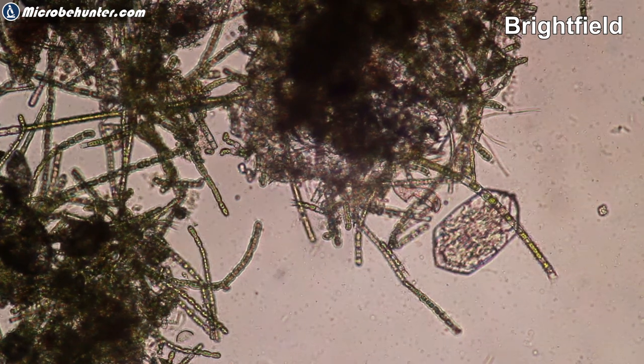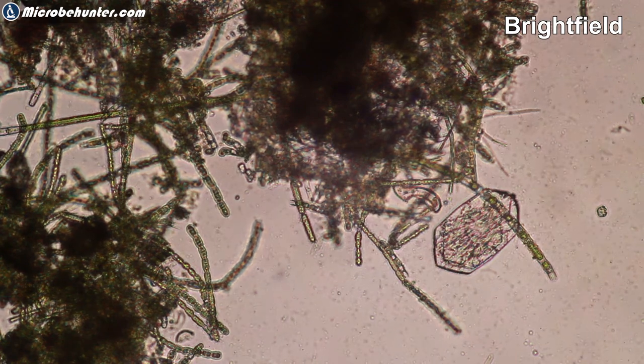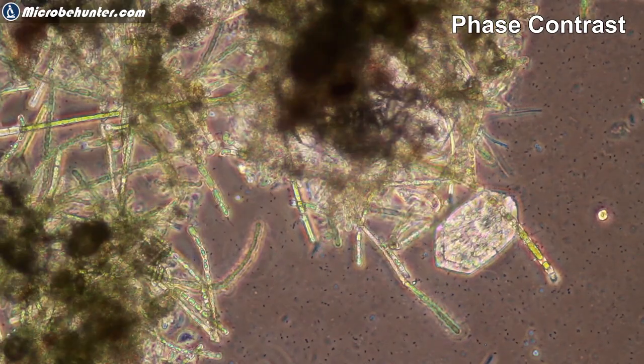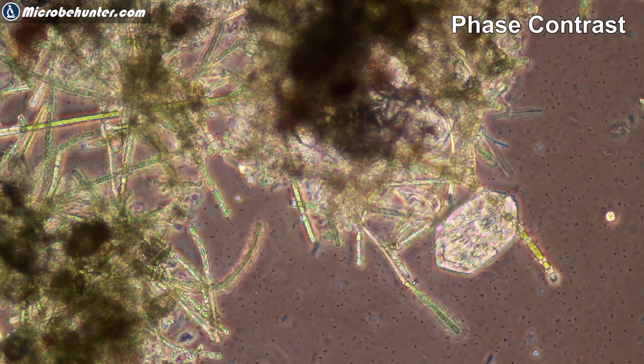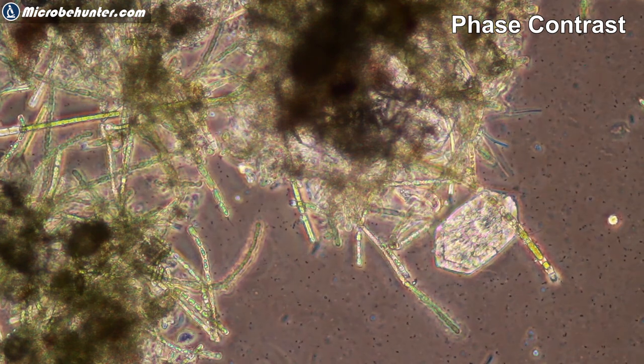Here again, the bacteria are a little bit better visible in bright field. And again, switching over to phase contrast. The structure that you see on the right side here seems to be some kind of a crystallite, but I don't quite know exactly. But now the bacteria are very clearly visible moving around.